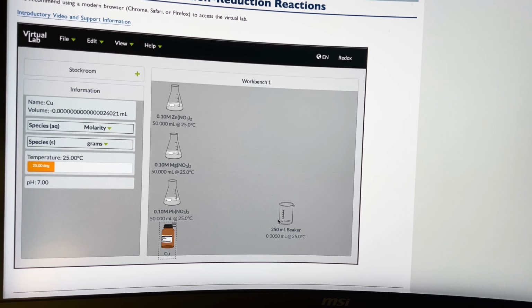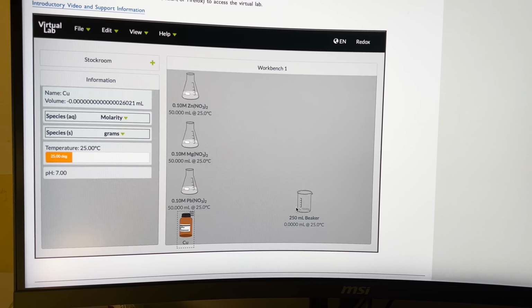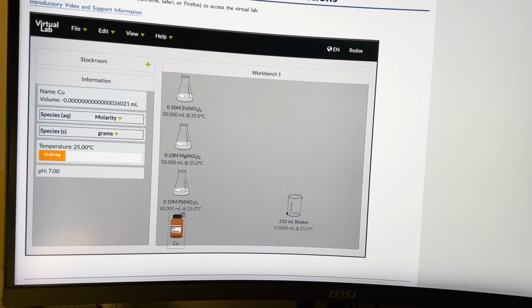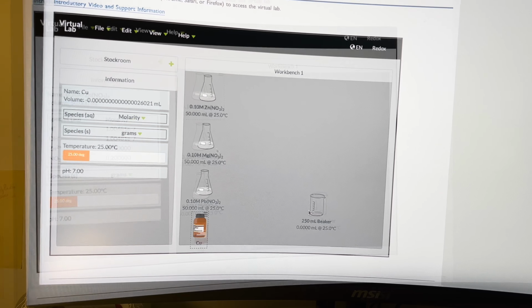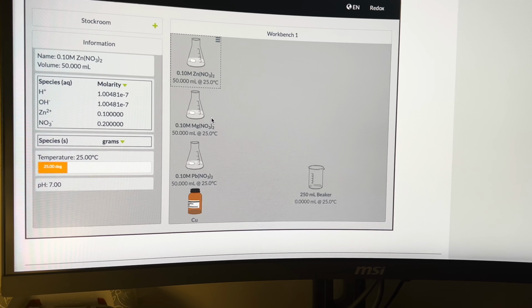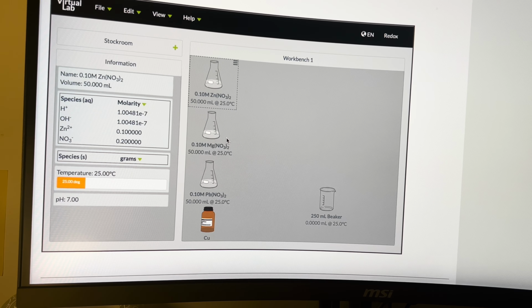If a reaction occurs, the metal loses electrons and is a stronger reducing agent. If no reaction occurs, it is weaker. I repeat this for all 4 metals with applicable metal nitrate solutions, keeping the mass and volume constant to make results comparable. First, we're going to start with the copper experiment. Copper metal's appearance is reddish brown, so that would be under qualitative observations.